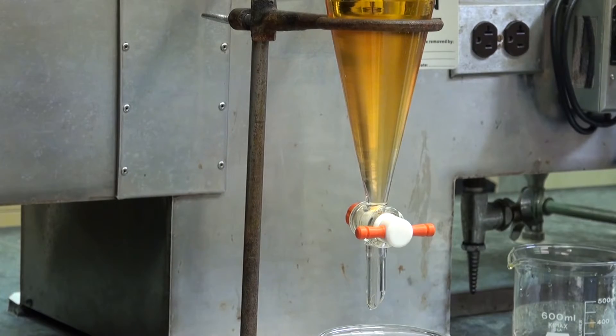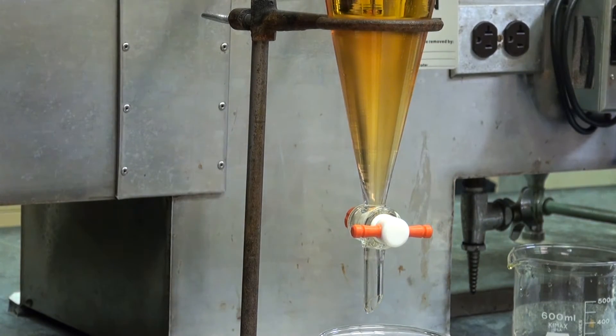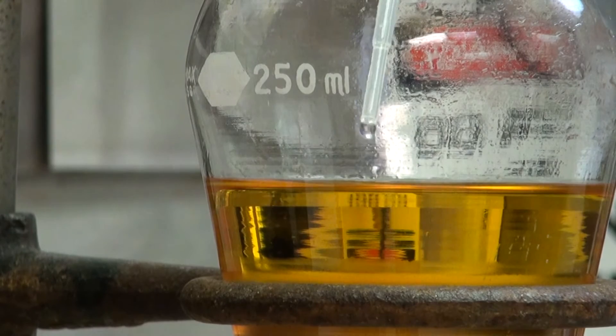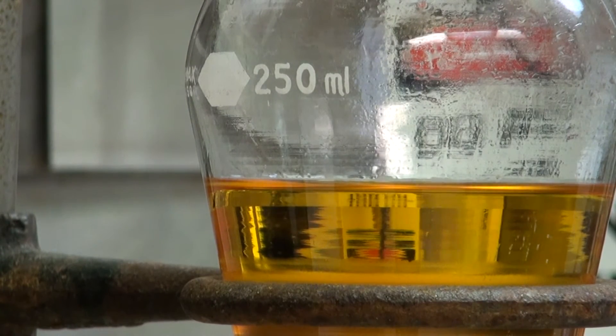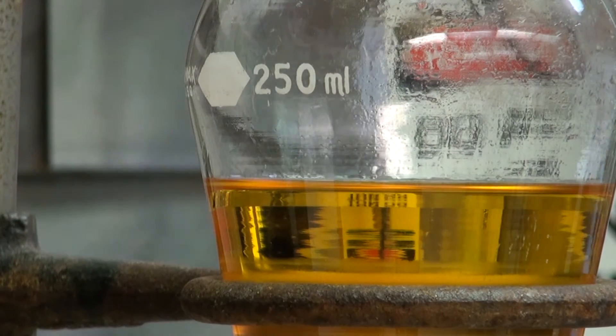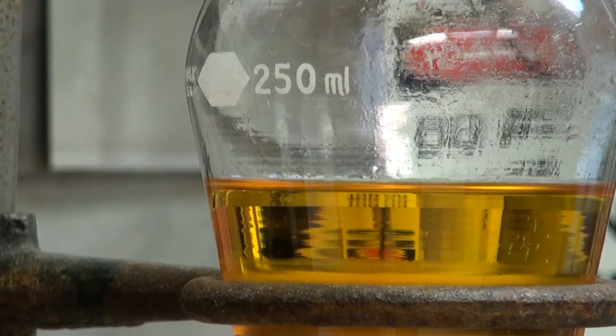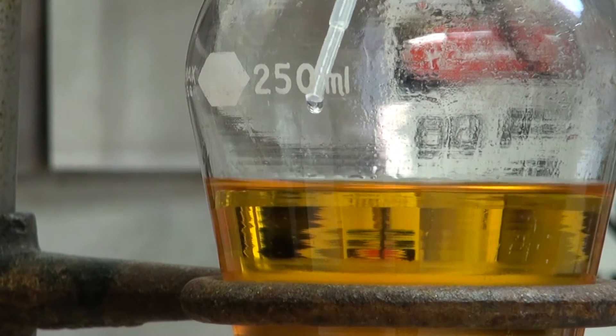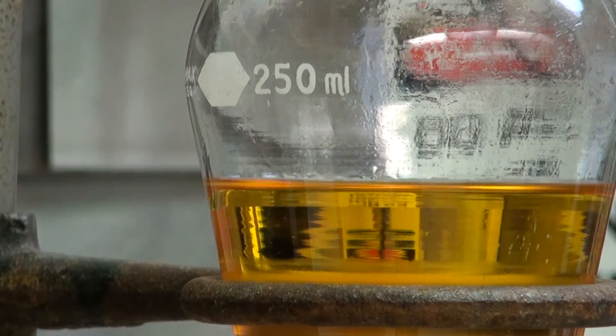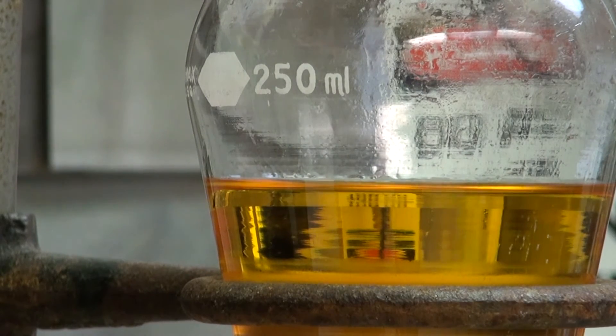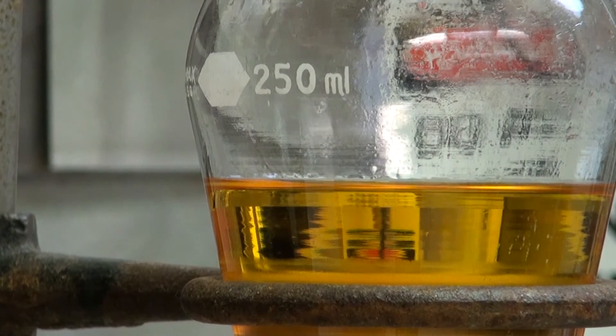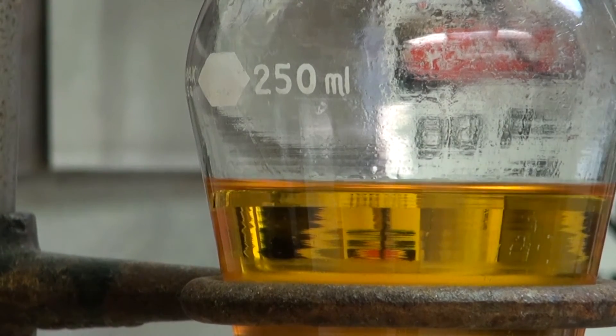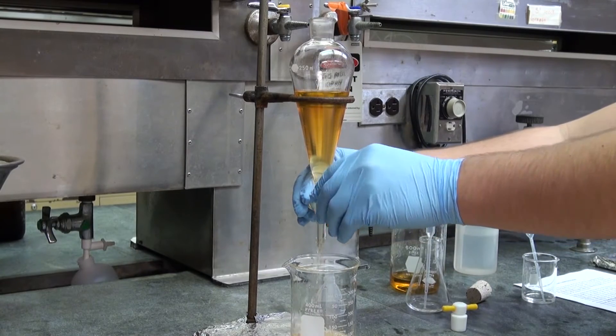Let the layers separate. To know which layer is which, you can use the density of the solvents. You can also use a drop test by adding a drop of water and following the drop. If it goes through the top layer, you know the bottom layer is the aqueous layer. Or if you add ether and the drop stays in the top layer, then the top layer is the ether layer. In this case, the top layer is the ether layer, which was seen by the drop test. Also, if you look at the density, ether will be lighter than water, so that is the top layer.